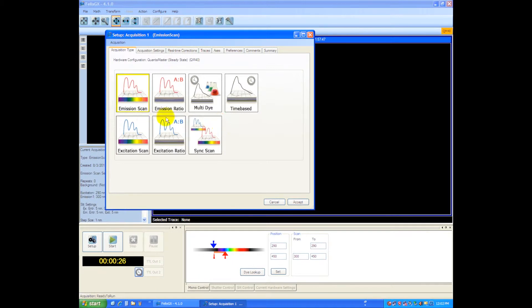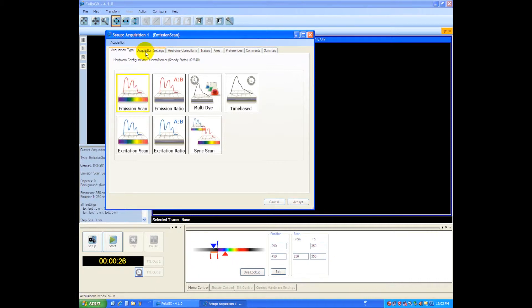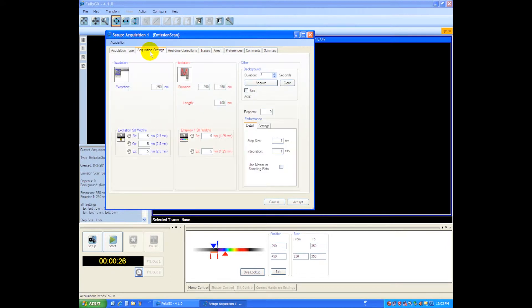So for the first one we simply click once here on emission scan, then we can go up and choose the parameters under acquisition settings. By clicking on this you can see you've got the excitation monochromator where you'll type in your excitation.